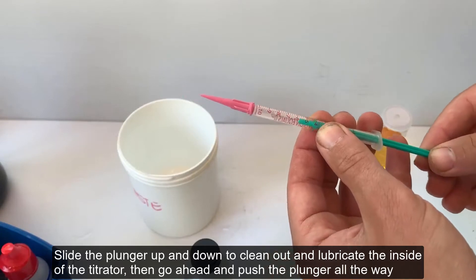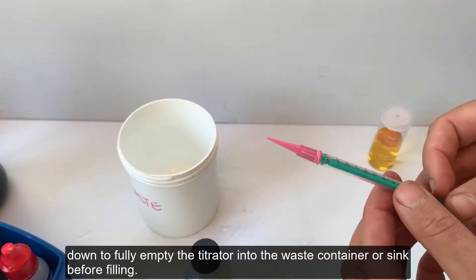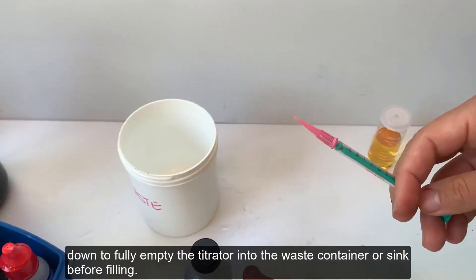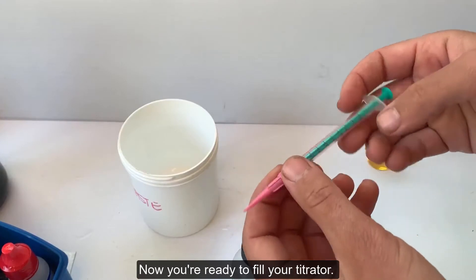Then go ahead and push the plunger all the way down to fully empty your titrator into the waste container or sink before filling. Now you are ready to fill your titrator.